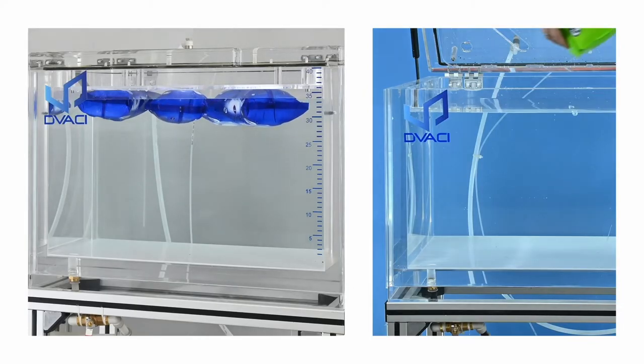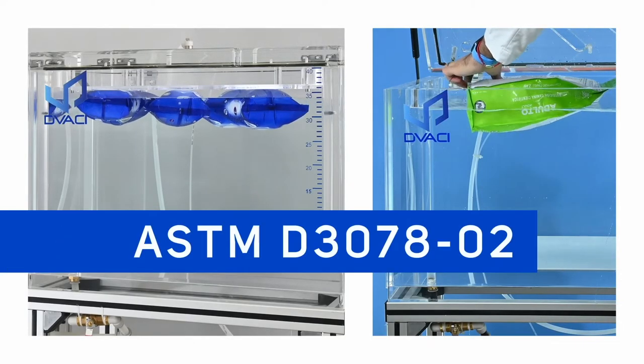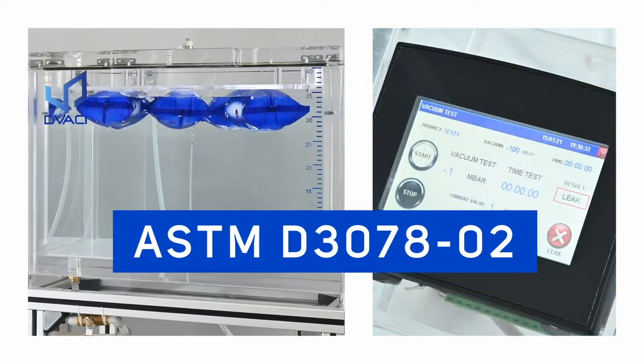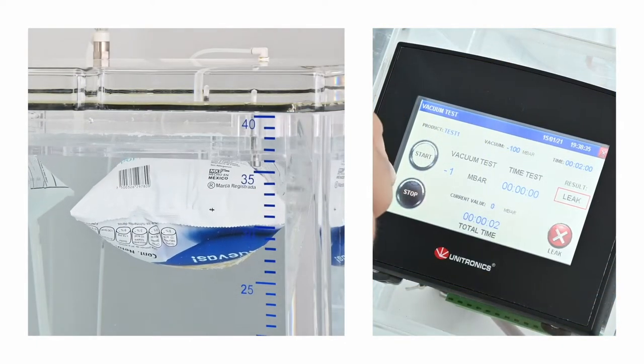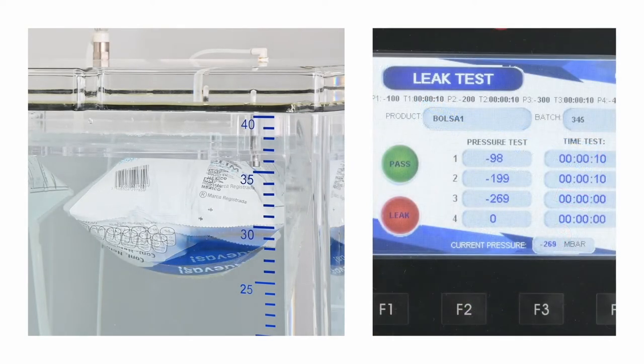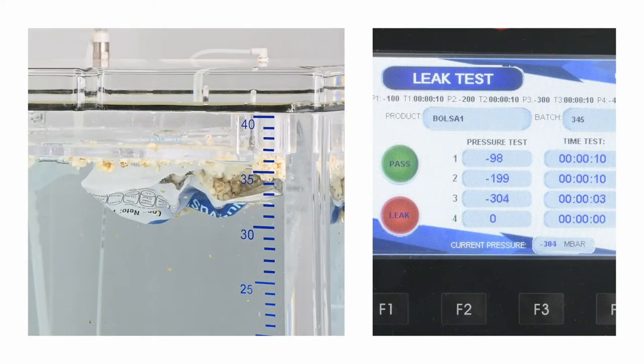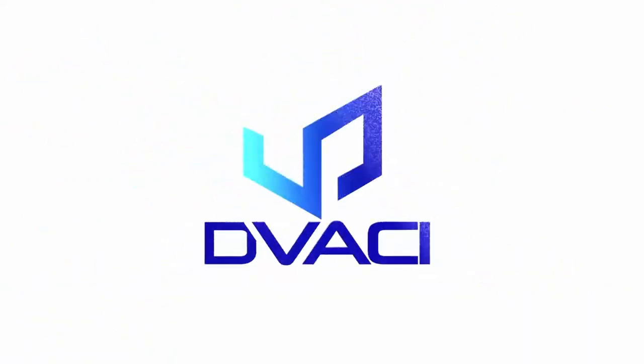This is a leak test by Bubble Emission, following the ASTM D3078 International Standard. The objective of this video is to help you understand the fundamentals behind this particular procedure so you can move beyond the basics and start implementing this method according to your production and quality needs.